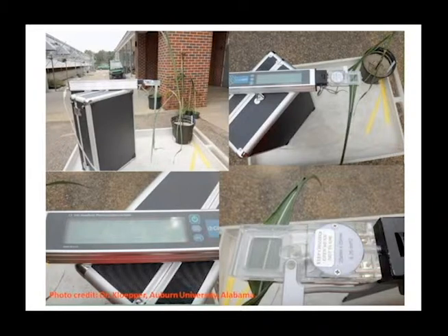So this is a very classic use of the handheld photosynthesis system. Here, instead of a tripod, the hard-sided case is used to prop up the photosynthesis system during measurements. We can see the small leaf chamber is used, and one of the upper mature leaves of the corn plant is having photosynthesis measured on it.